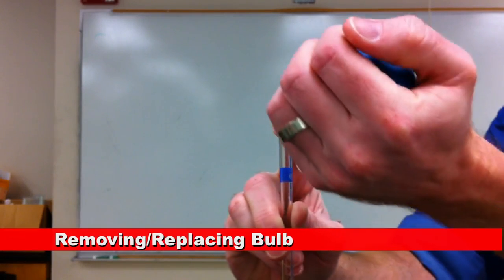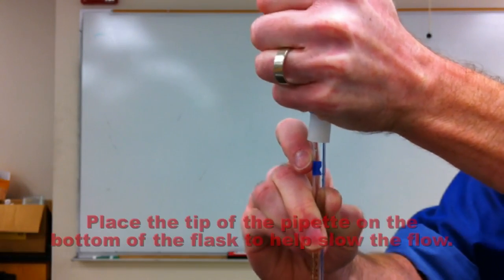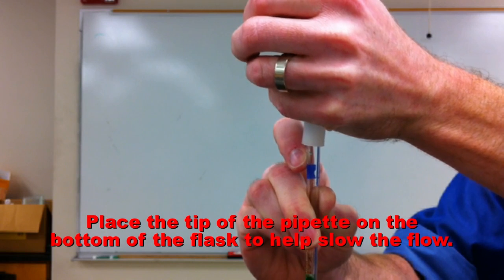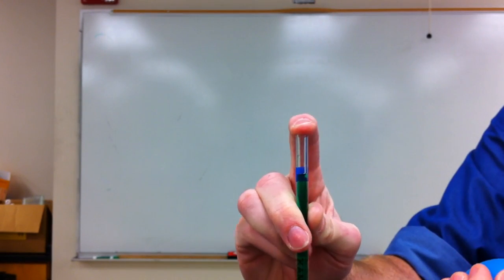Do not use your index finger to hold your pipette. Keep your index finger free so that you can quickly replace the bulb with your finger so that you do not lose significant volume when transferring.